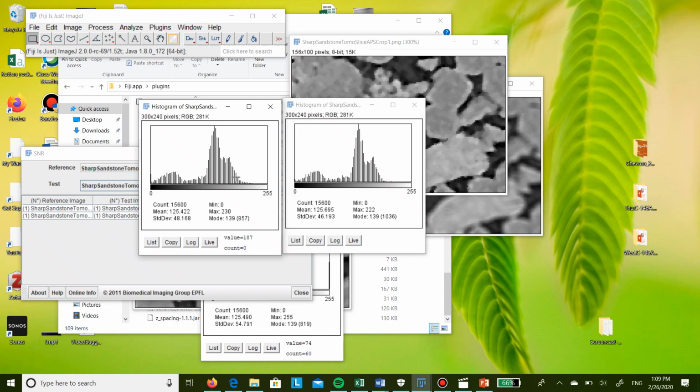Okay. But basically, do you see how that can be used for verification of how these things work and how well they work? Add noise, remove, and then see how good it is. Or remove by different filters, so you can also see how different filters work against different types of noise. The problem is, again, with X-ray images or the like, it's a little harder to qualify the noise as just salt and pepper or random type of noise.